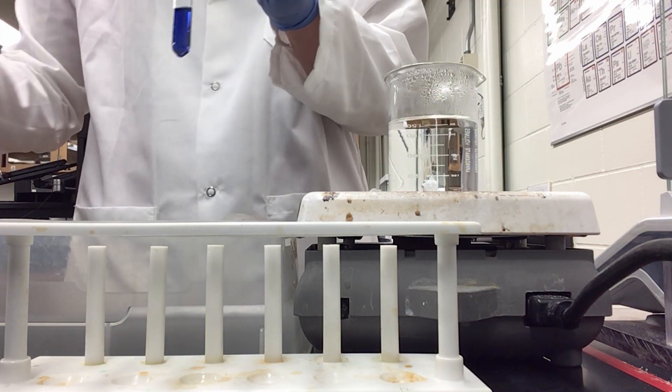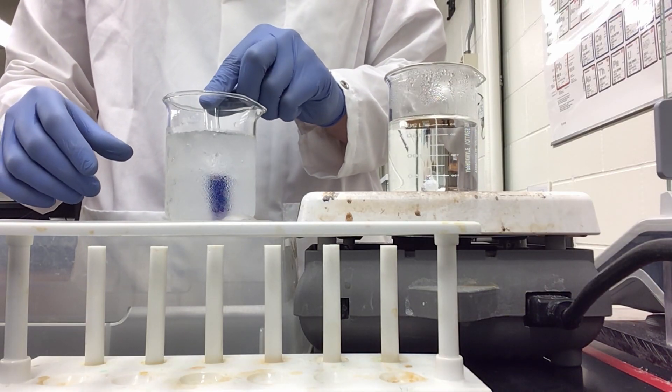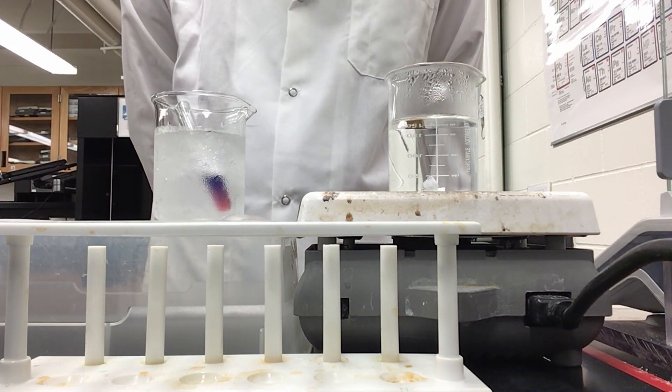Now I'm going to take this and immediately add it to an ice water bath. And as you can already see, we are starting to get pink to come back into the solution.